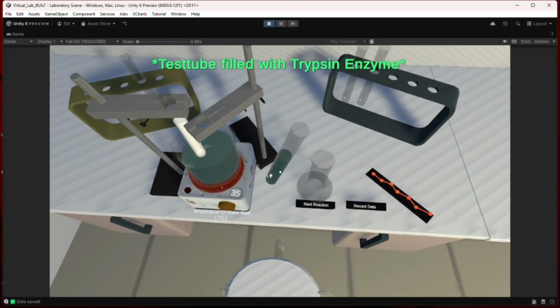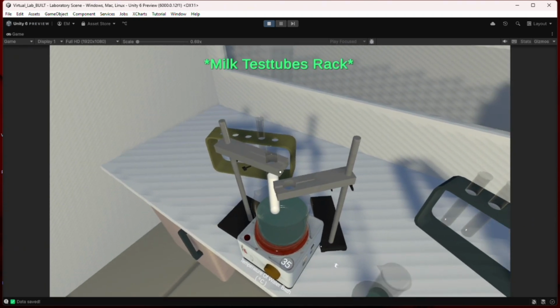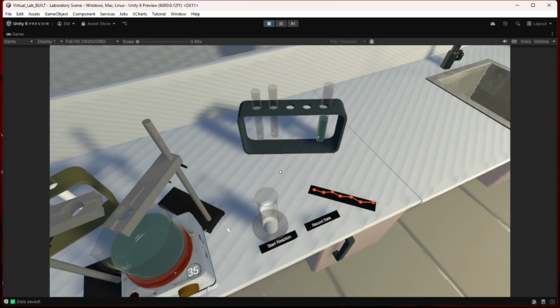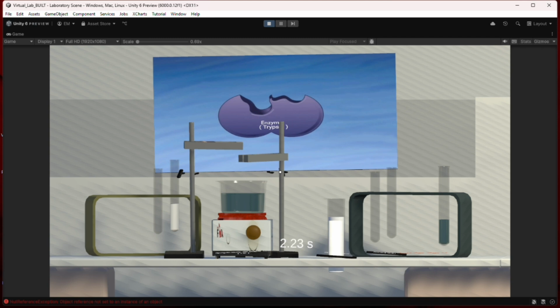I came up with another Unity simulation demo I made. Virtual lab simulation. In here, we can test enzyme activity in breaking down milk with different factors. In this laboratory demo, every simulation logic is driven by actual formulas put in code, and we can save data which are stored in a JSON database.